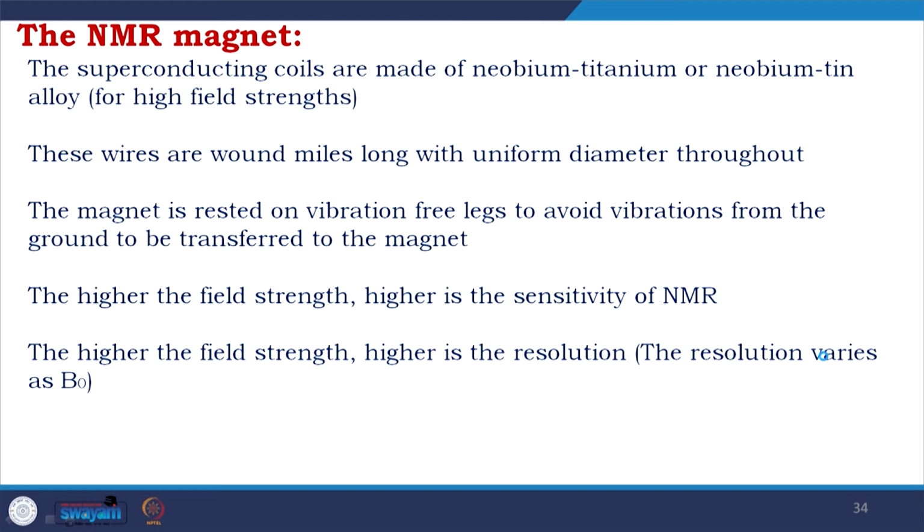The higher the field strength, the higher the resolution. So, when you increase the field strength, you increase the resolution. About this we will discuss specially when we discuss protein NMR.